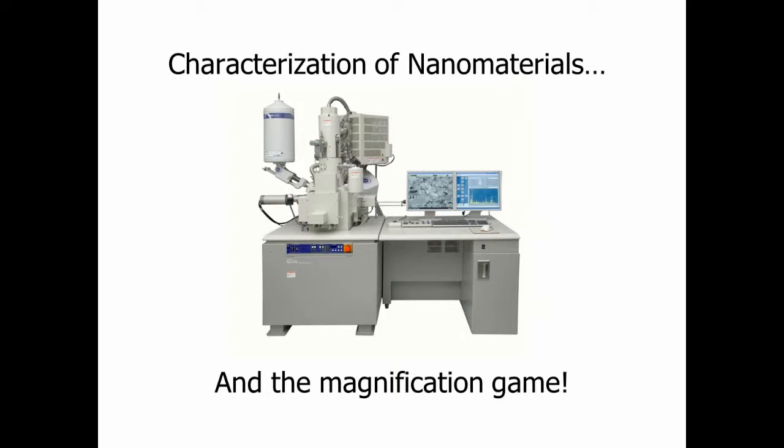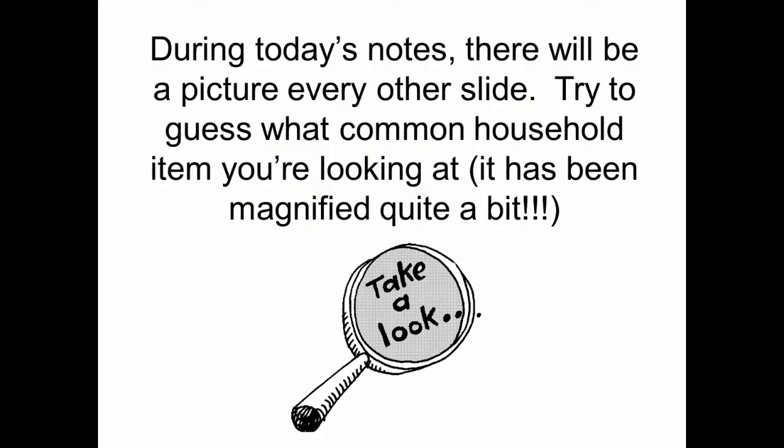All right, this is kind of a long lecture, but it's a really important one. We're talking about how you can see really small stuff. In other words, the characterization of nanomaterials. And throughout this slideshow, you're going to see a bunch of pictures that are SEM images of common household items.